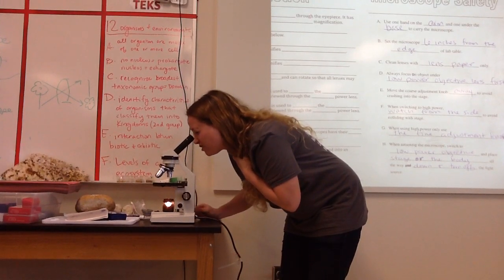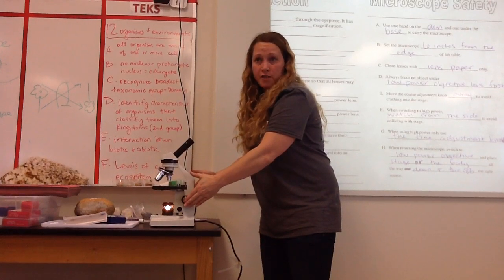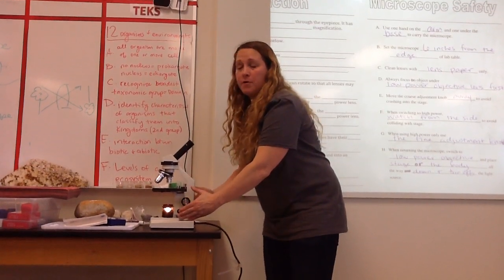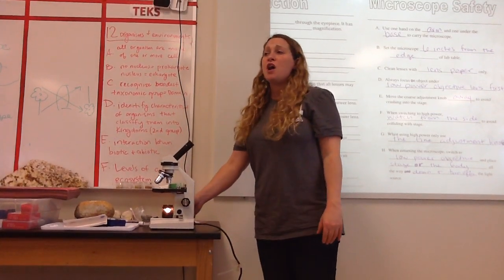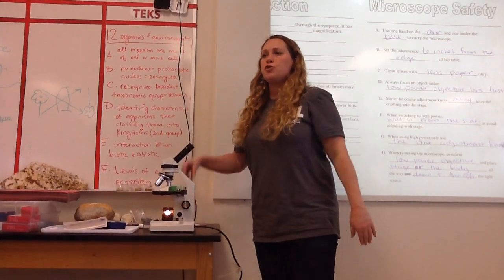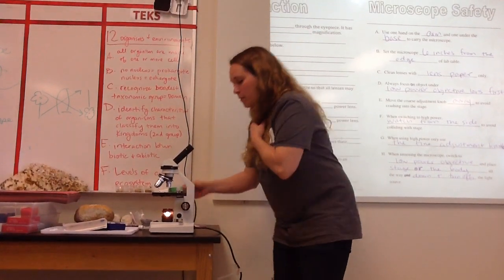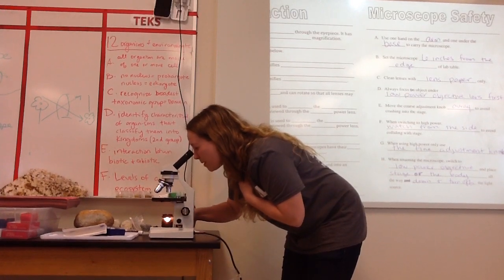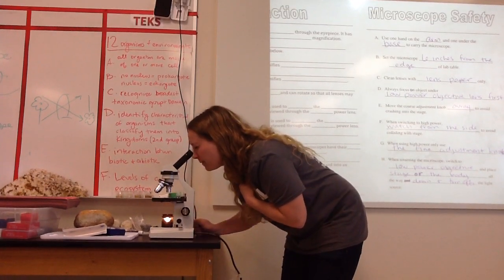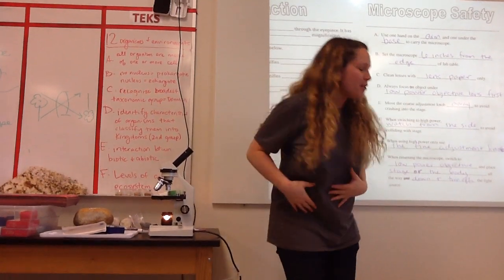When it gets really close to clear, then I'm ready to stop the fat knob, the coarse adjustment knob, and switch to the little knob called the fine adjustment knob. This one puts the finishing touches. On the fine knob, it doesn't move it very much, so you can move it forward or back without destroying any slide. Does that make sense? So when I handle the little knob, now I can go forward or back till it's clear. Ooh, it's a pretty cell. Okay? Way to go, me! Okay, so thank you, I'll take the applause.